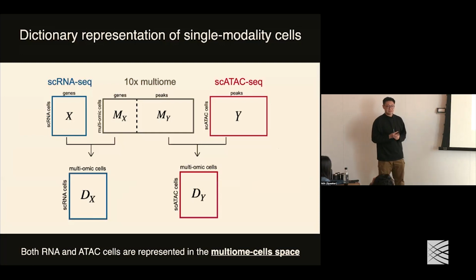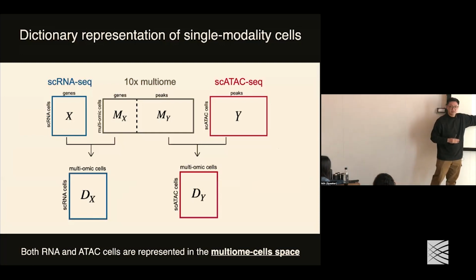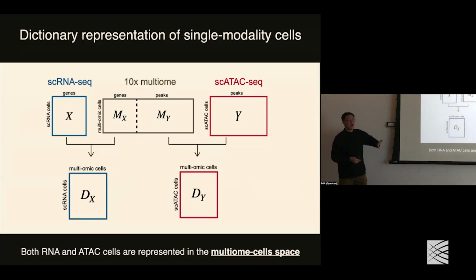Our first idea is that if we can aggregate this matrix just based on their annotations, right? Maybe just based on if they are all T cells, we can aggregate a little bit. Or we can do this based on their clustering results. But then we realize that if we do that, all this bridge integration will be highly dependent on how we annotate those bridge data sets. Then we think, okay, can we have a more continuous way to smooth this matrix or decrease the dimension?